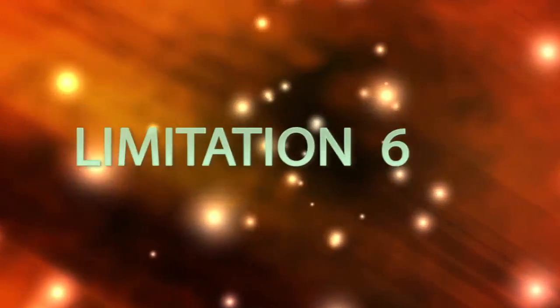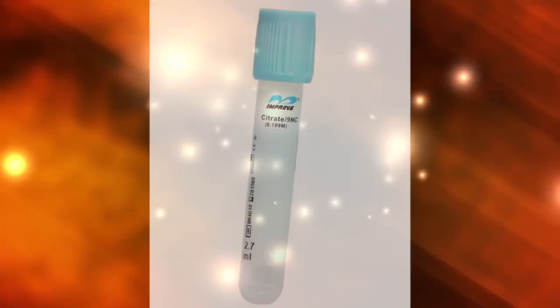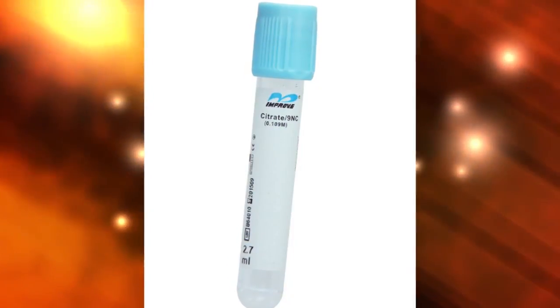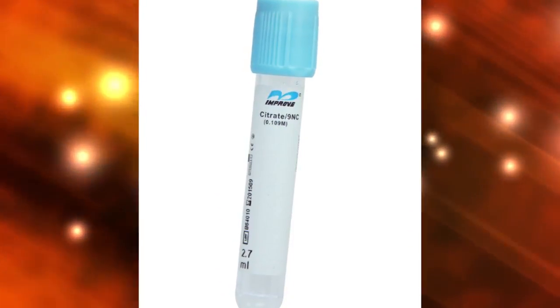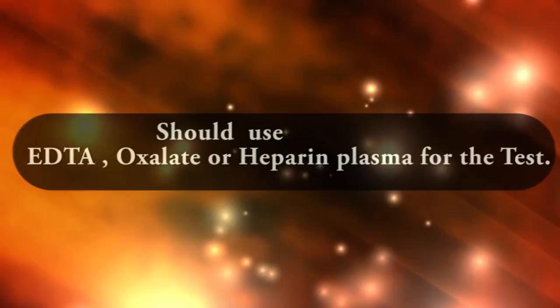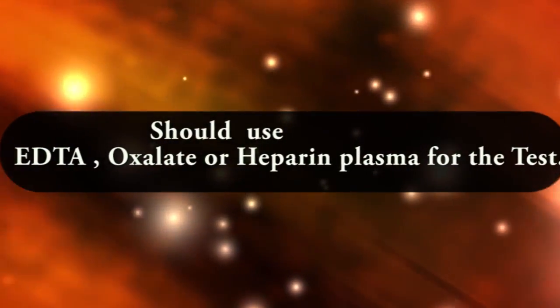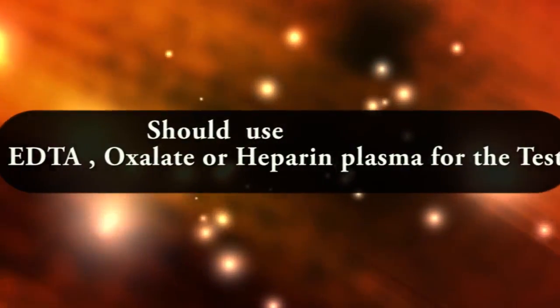Tube Method. Limitation Number 6: Citrate plasma may be clotted by any organism that can utilize citrate. Therefore, EDTA, oxalate, or heparin plasma should be used for the test.